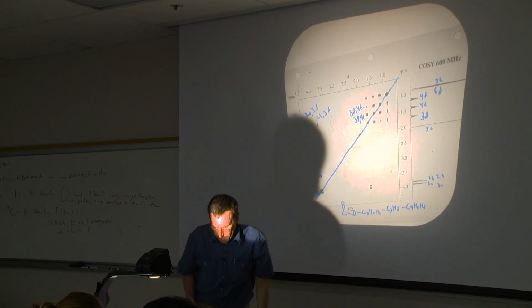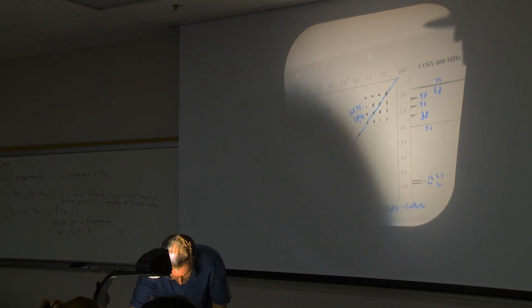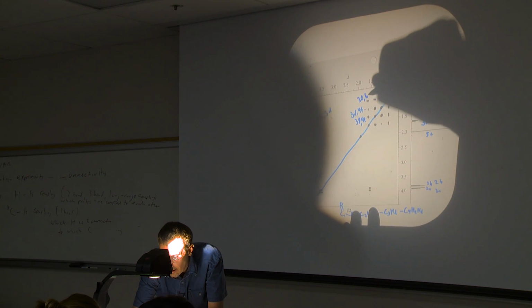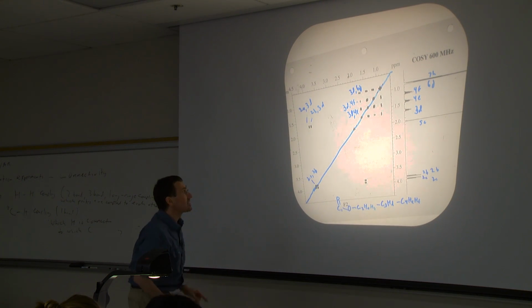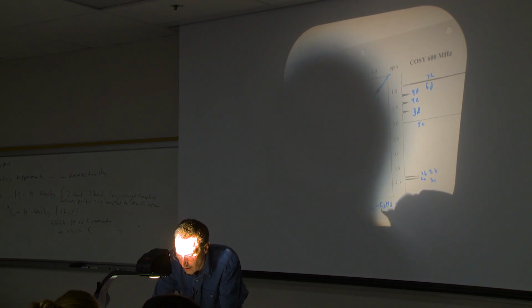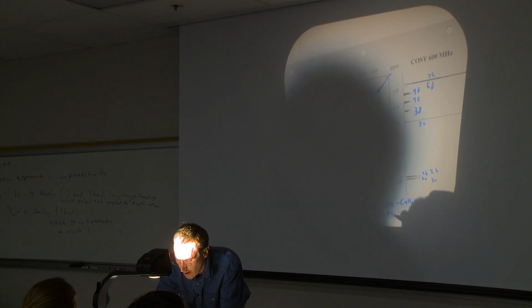So that cross peak over there is going to be 3D with 6G. And that's useful because it says now that I go ahead, I have a valence here, I can attach my C6H3G methyl group.